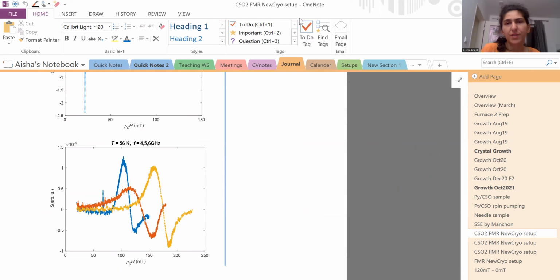But the last thing that I would like to show you, which you should include in your digital journaling, is a very simple way, but it's quite effective. So after these two things, you can actually also include PowerPoint sheets. So I will tell you an advantage.